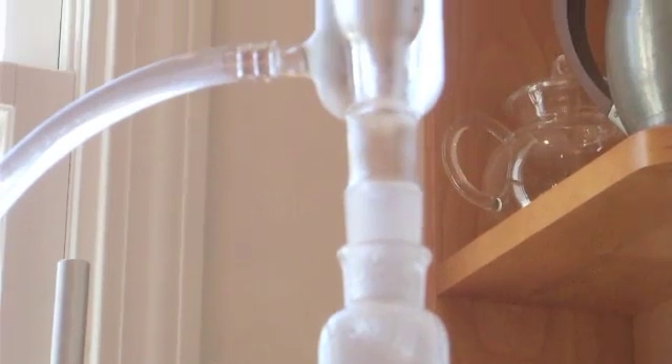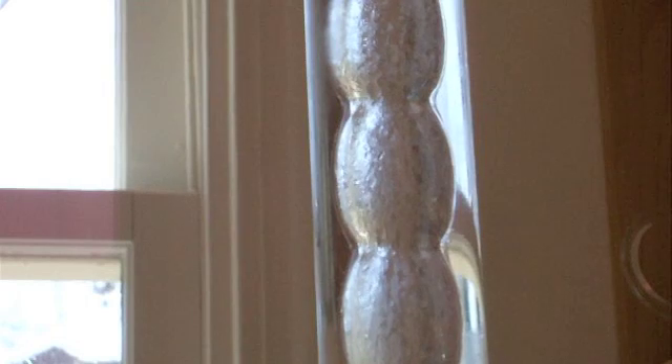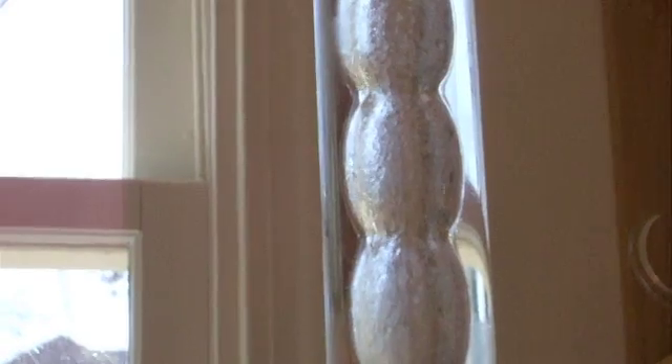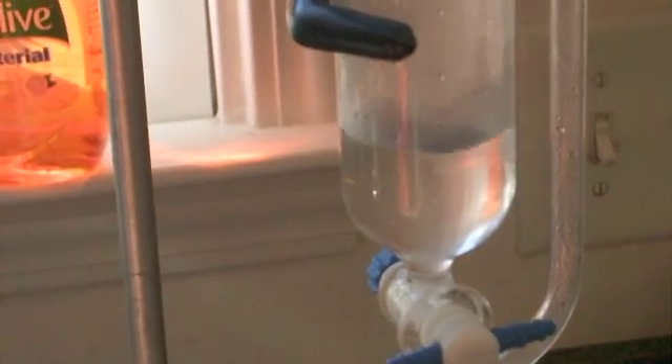We should start to see our first drops condensing in the condenser and running into the collection vessel — the separatory funnel. There's our oil and water condensing in the condenser. And if we just move down, you see it dripping down into the separatory funnel.